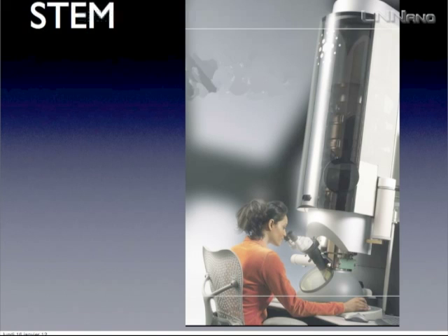You may wonder why we don't put this part on the ground. It will make sense if you make a STEM, because the most critical part is the part forming the probe. What happens after is totally irrelevant. Just like in a TEM, the most important part is the bottom part, the second part of the objective lens and the projectors.